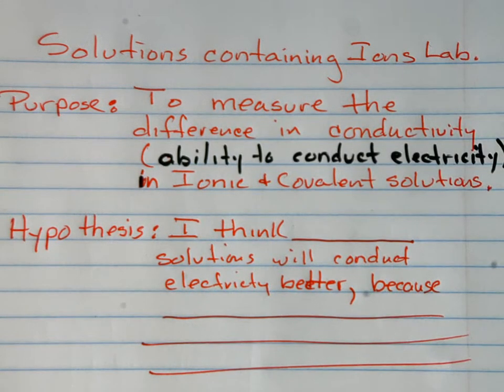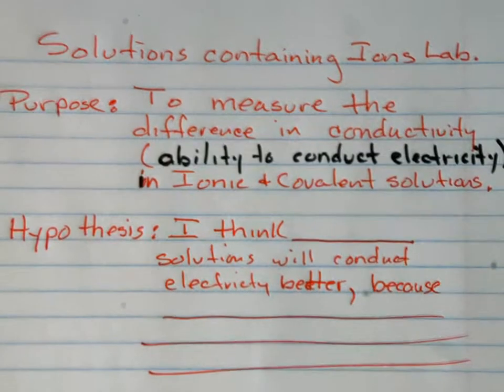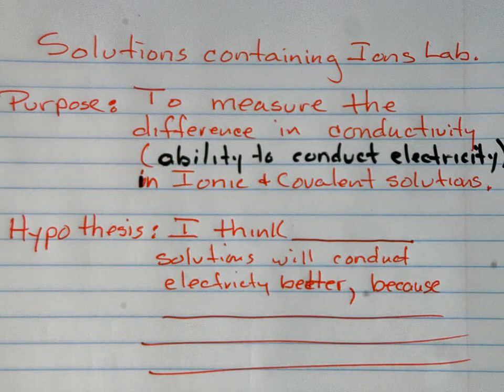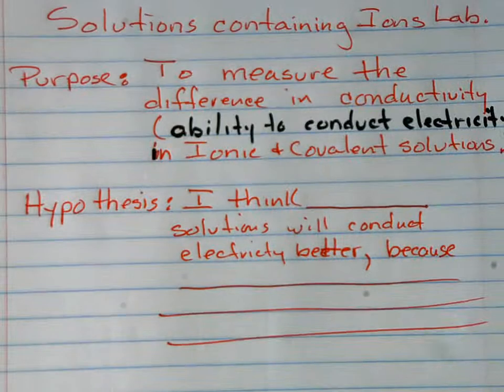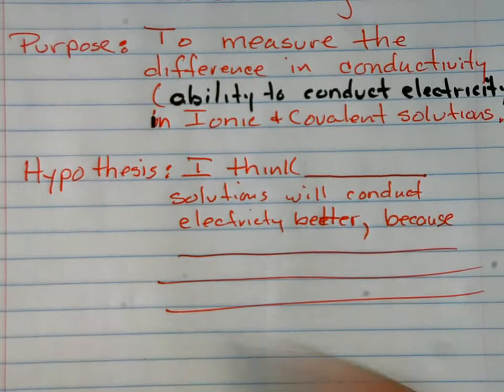Actually, tell you what, maybe before we do that, let's make the data table, because then you can look at what the solutions are. So keep that in mind. Let's get the data table, plus I got to keep this going right now for the people that are not here. So let's make the data table so you know what it is we're measuring.